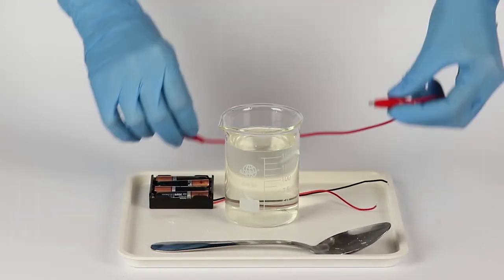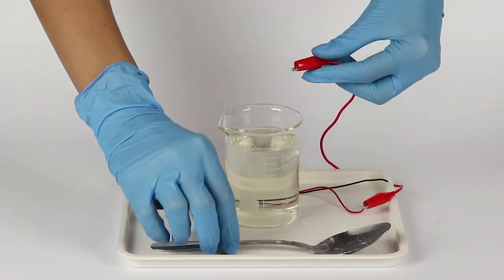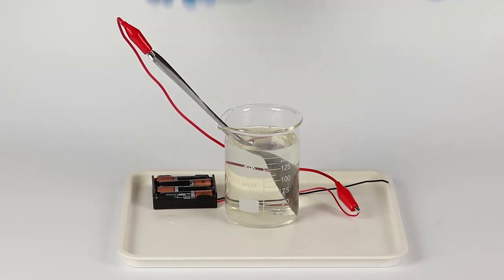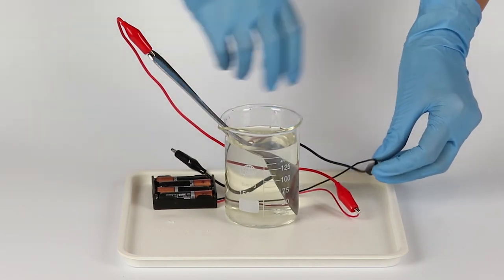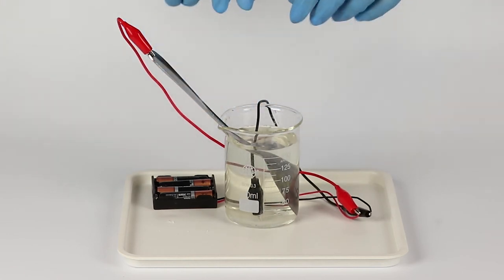Take the battery holder with the batteries and connect the red wire with it using the red crocodile clip wire. Put the spoon into the solution and attach the clip to it. Now connect the black crocodile clip wire to the black wire of the holder. Put the loose end of the wire into the solution and the electrolysis process will start.